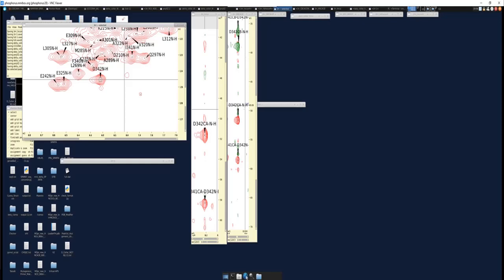Hello, and welcome to part 2 of the protein assignment videos. In this video, we're going to cover additional triple resonance experiments that can be used to assist an assignment, as well as how to use NOESYs for backbone assignments.